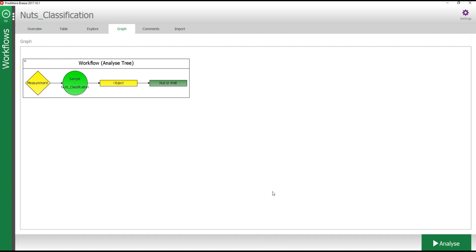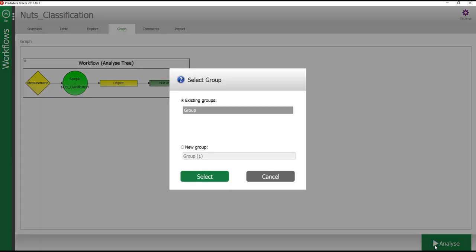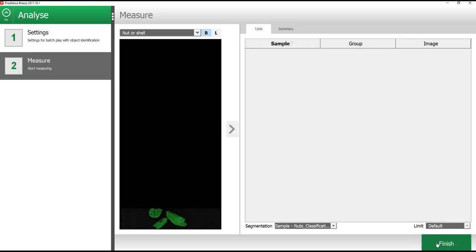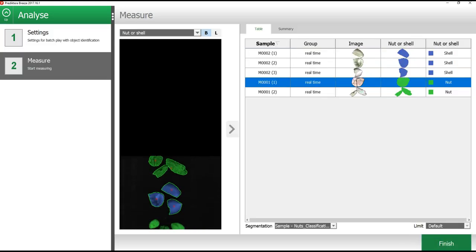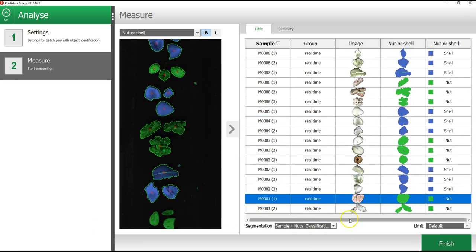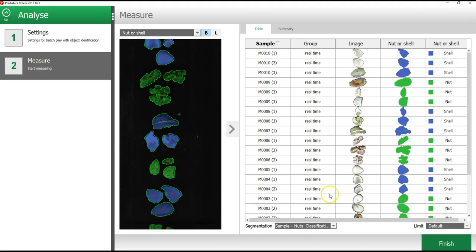If your computer is not connected to a camera, you can simulate this by using the camera simulator in Breeze. To do that, press the analyze button. In the window that appears, I will select to generate a new group to store these images. As you can see, the image is analyzed in real time and the results are displayed in the table.